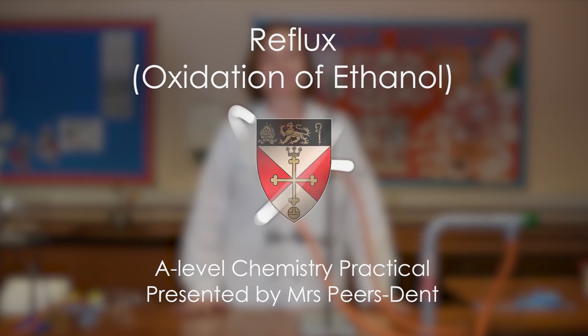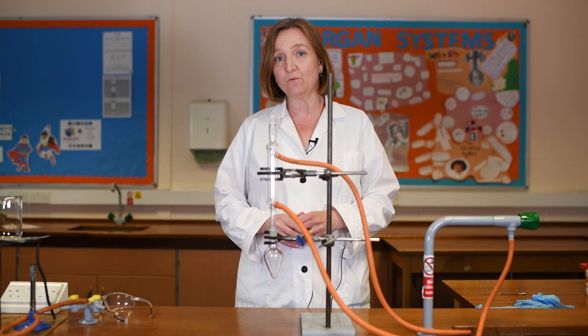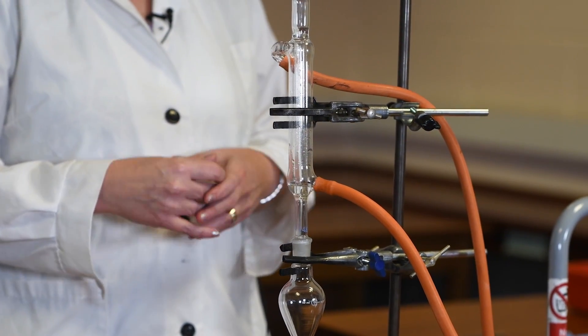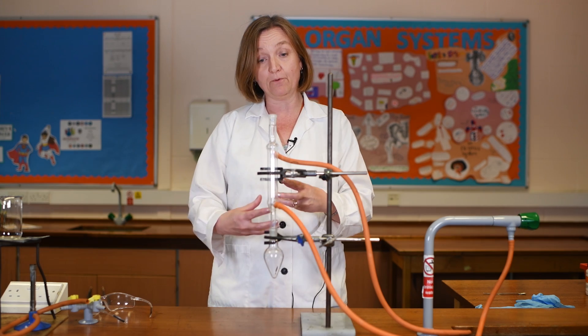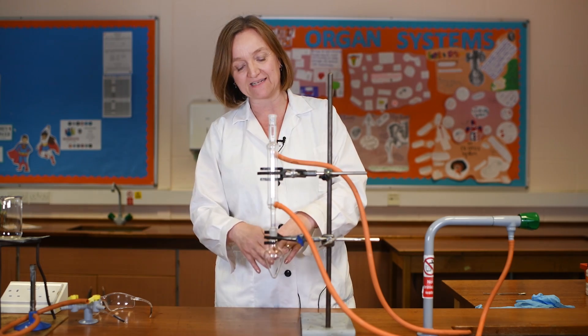Welcome back to Malmesbury Science where today we're going to look at a really important chemistry practical technique covered on all of the A-level specifications. That is the method of heating an organic substance under reflux. This means keeping something on the boil but having a condenser vertically above the flask where you are heating your reactants. As the reactants boil, the more volatile components will evaporate, come up into the condenser, condense, and drip back down into the reaction vessel. This means you can keep something on the boil for a long period of time without any loss of reactant or product.